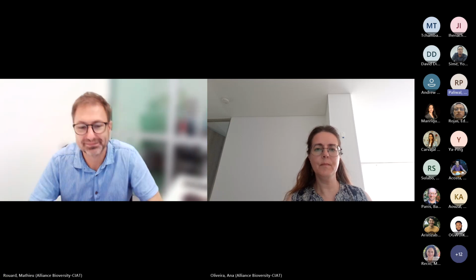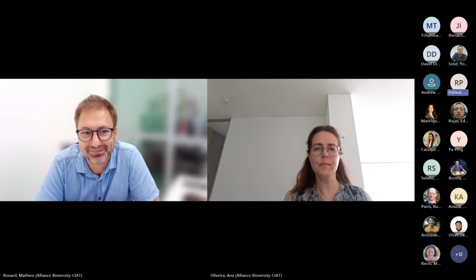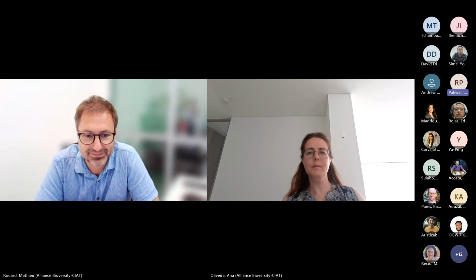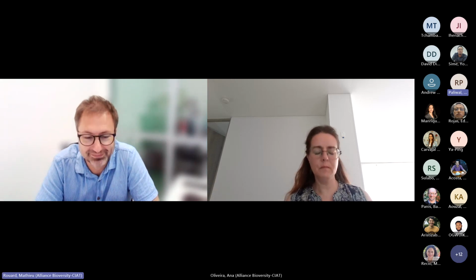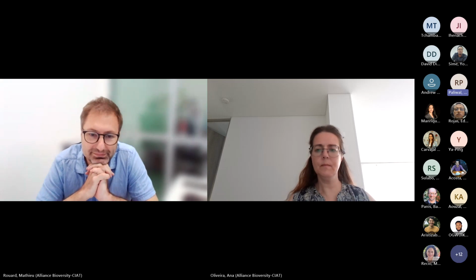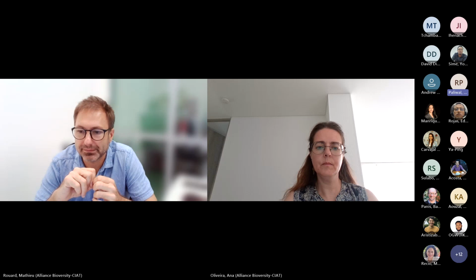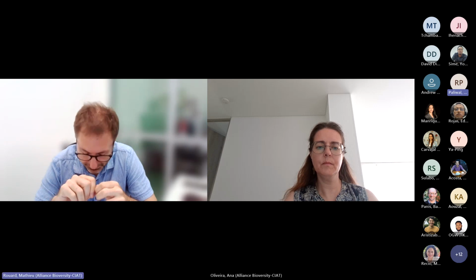Really, this is useful because sometimes I have published a paper and they ask, give me where is your data. So I already loaded the data in the GWA. I said this is our link, the data is here. This really works for us, very easy for us, not to go to something like Dryad and fix things there to load the data and give the link. We can load it in our GeneBank GWA and give that link to them. It works well.